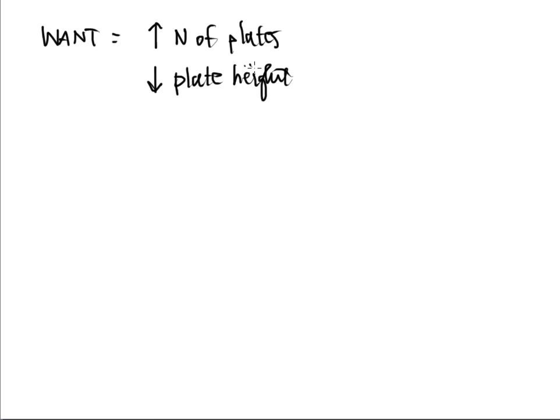Low plate heights give you better separation. A large number of plates give you better separation. And these two go hand in hand.